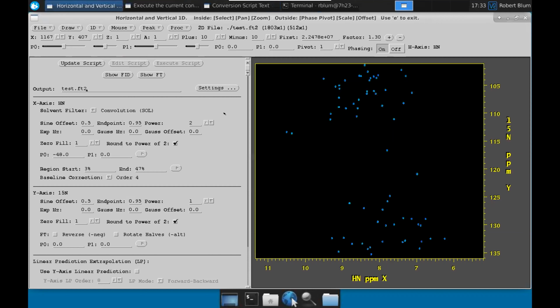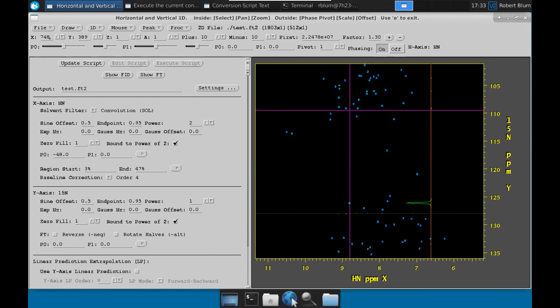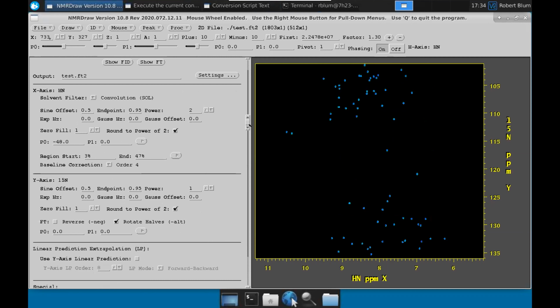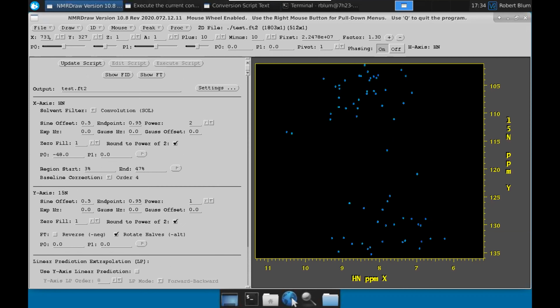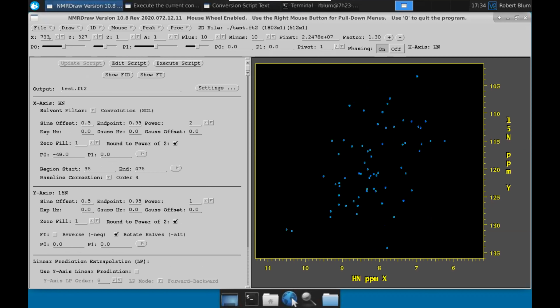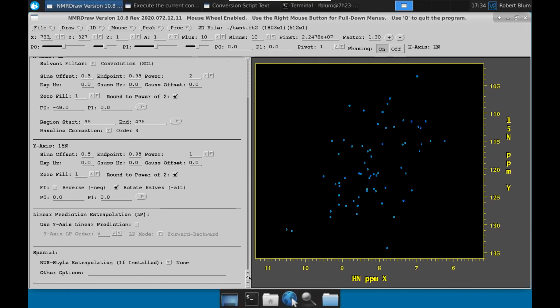Okay, so beautifully phased. Now what else do we have to change? I just wanted to check again just to be sure. Okay, everything looks great. As you said, the y-axis is not centered. Hopefully you set your experiment so that your data is not at the edge of your spectral window. So it's likely that that box needs to be checked. That's better. I guess you could set it so that it's at the edge, but that doesn't make any sense because it would be a really weird spectrum to actually look like that naturally. I guess it's not impossible.